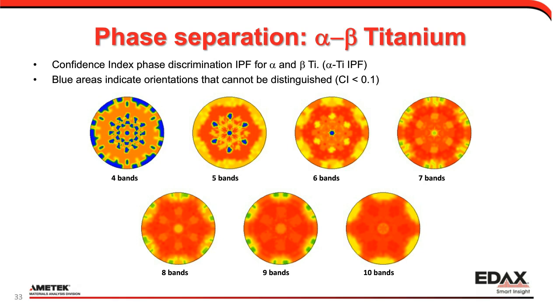Okay, somebody is asking a question, and this is one of those good questions. How do I know which reflector to activate? I frequently have the problem that the CI, simulation, material files and Hough settings look fine, but the scan still looks horrible. So the easiest way to do that is what's called band detective.